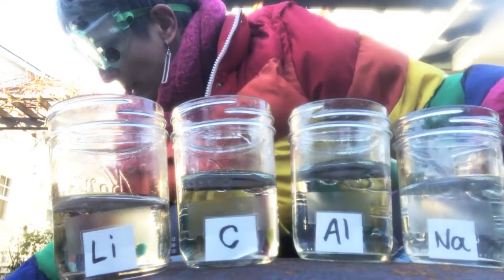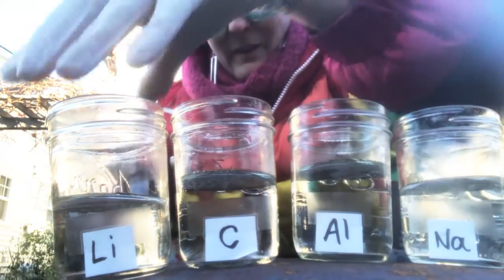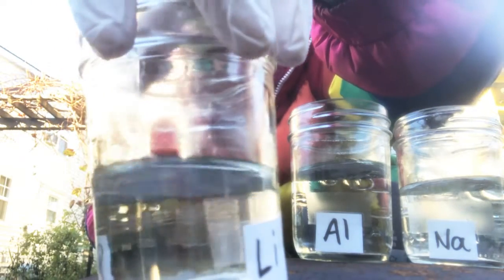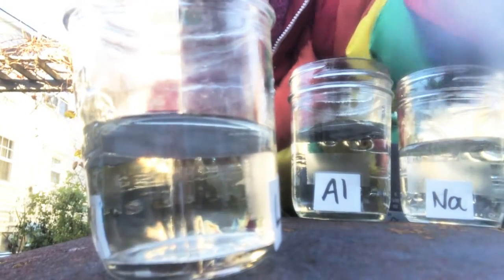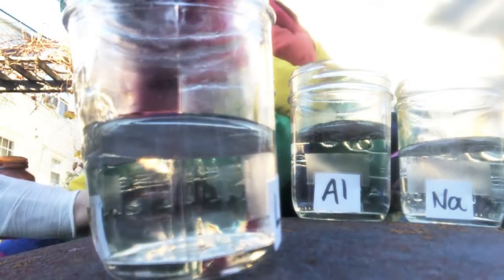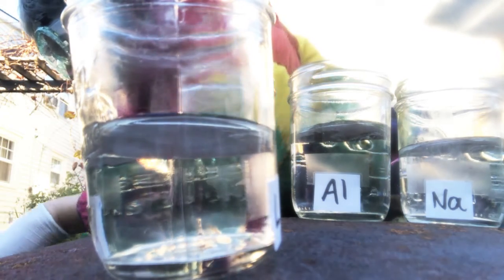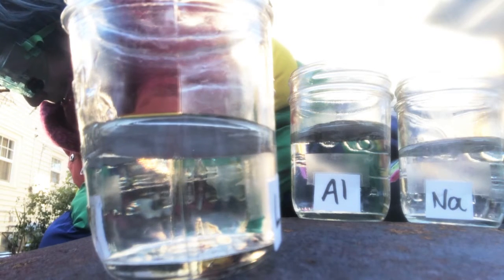I'm going to start with the lithium. So we're going to open up the jar here. I'm going to move the lithium a little bit closer to you so you can have an opportunity to see what's going on with this potential reaction. So I've got a piece of lithium. I'm going to use a knife to cut it.